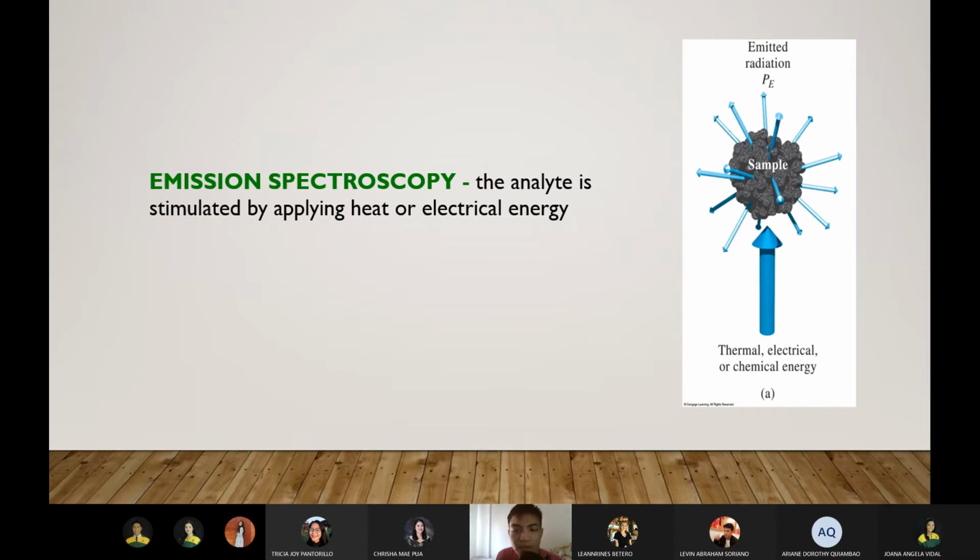Okay? So, depending on the amount of light emitted, you can quantify gaano karaming atoms meron dyan. Okay? So, ito yung ginamit ko sa thesis ko in the form of AAS, no? Atomic Absorption Spectroscopy or Atomic Emission Spectroscopy. Okay? So, ganun ginawa ko doon. Sinunog ko yung aking sample. Nag-glow siya. Kulay green. And then, yan. Pwede mo ma-measure gaano siya karami doon.